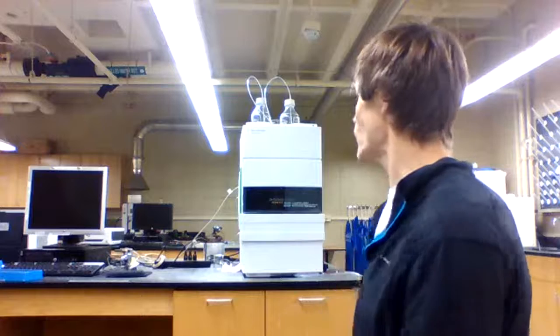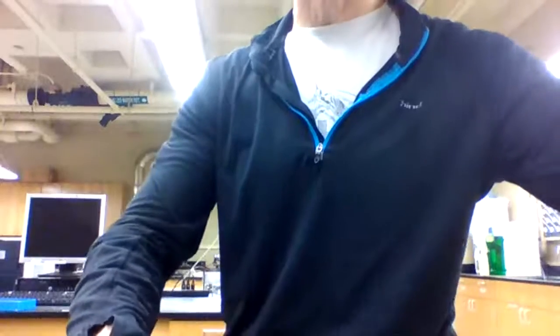So let's look at the instrument that we use for instrumental analysis. If you take Chem 4230, you'll get to use this instrument. The first thing we need to do is inject our samples. So let's show you what you will be working with.